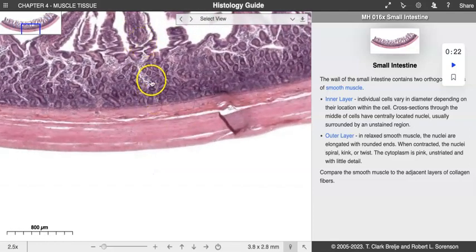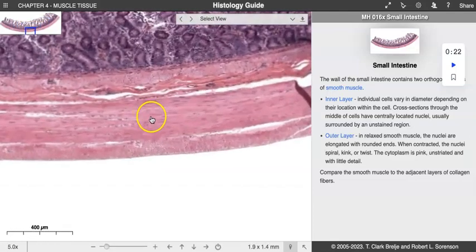And again, this is all villi and crypt material here. And then we really want to make sure that we're not hitting connective tissue, which is here, and we really want to get into muscle. You might be confused a little bit because it's like, well, that looks like this, and you would be right. That is actually a little bit of smooth muscle right here, which we'll talk about when we get to the intestine. That's what we call the muscularis mucosae, and that is a little bit of smooth muscle. And then you have a span of connective tissue here, and then you run back into smooth muscle again. So some of the connective tissue can actually throw you off because it does look so similar to smooth muscle. That's why I say don't worry about that.